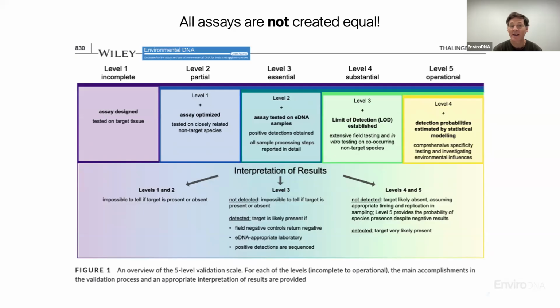because this process of validation is an ongoing process, obviously. Something that is valid today in a particular project area may not be valid outside that project area, and it may not be valid in a year's time if new data comes along. You can work with the best data that you have available to you at a given time. But it's something you should be thinking about when you are deploying a qPCR assay. What efforts have been made to validate this assay, so that you can be confident of the results, because there is enough uncertainty in the results of a well-performing assay without having complications from difficult assays.